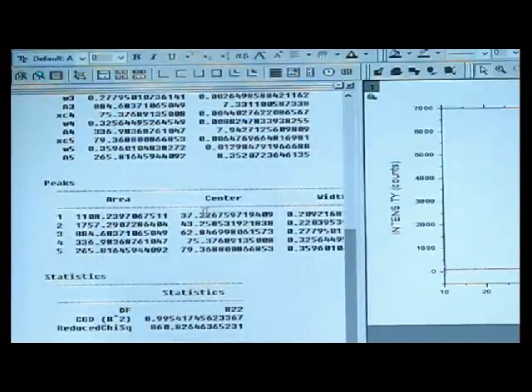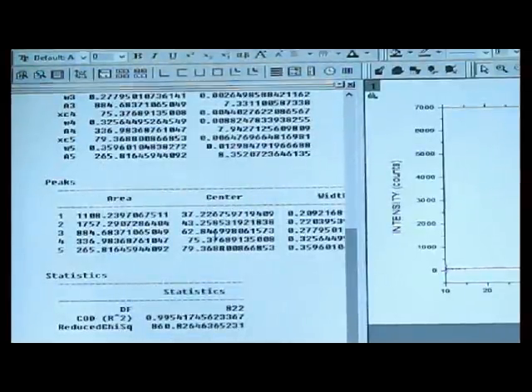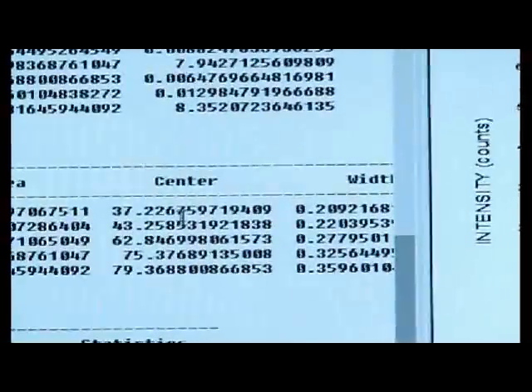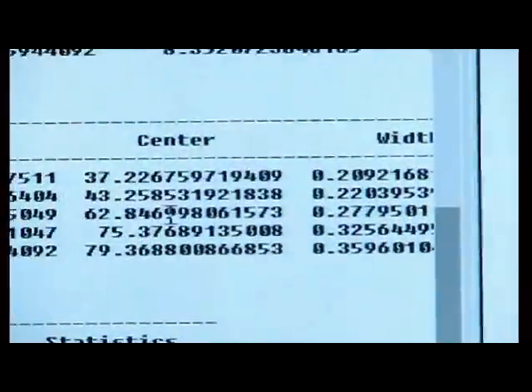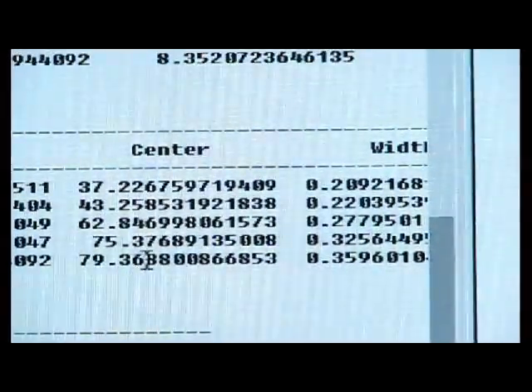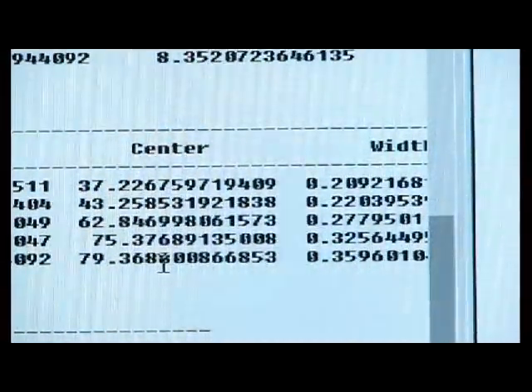Now we get all the 5 peak positions. That is 37.22, 43.25, 62.84, 75.37, and 79.36.